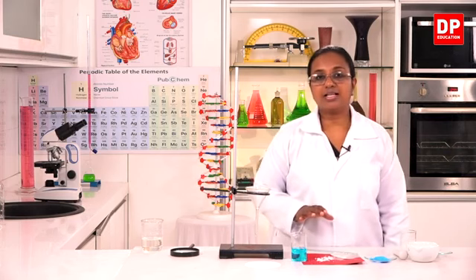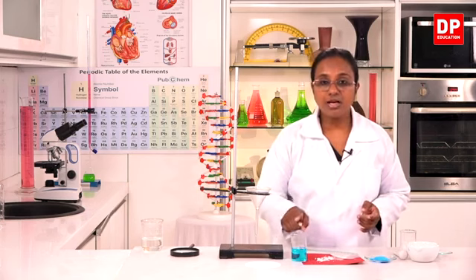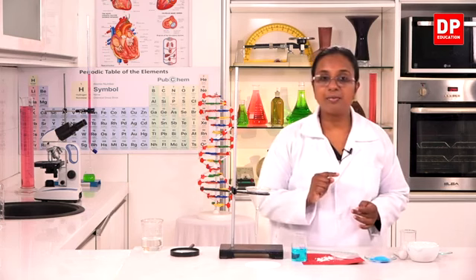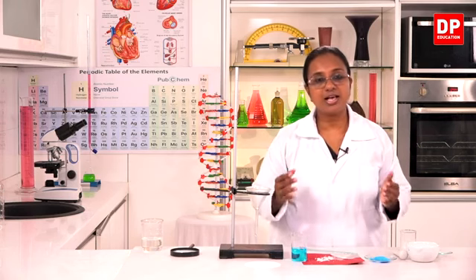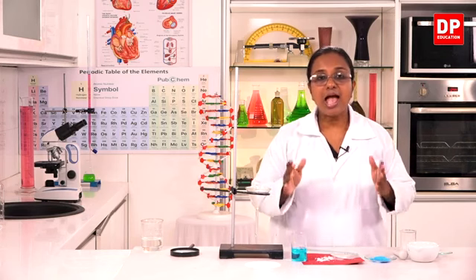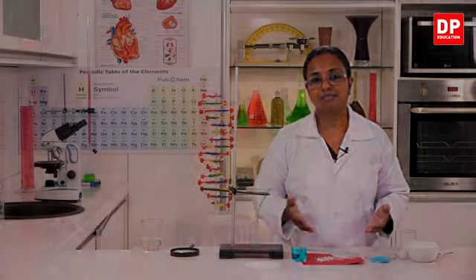From this activity, you all can understand, students, mixtures are made up of more than one pure component and it is mixed together. But when it gets mixed, you can see the chemical property of naphthalene hasn't changed, chemical property of copper sulfate has not changed. So, chemical properties don't change, and also the components of a mixture can be separated by physical methods.